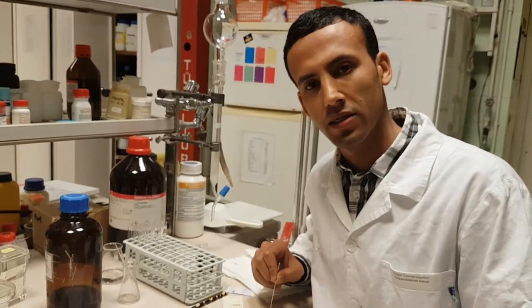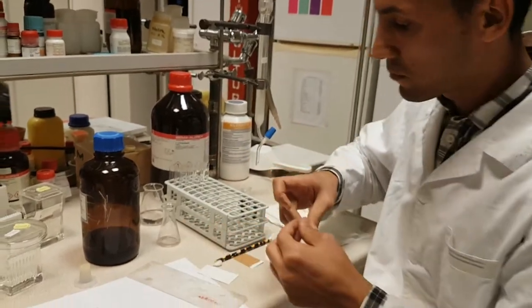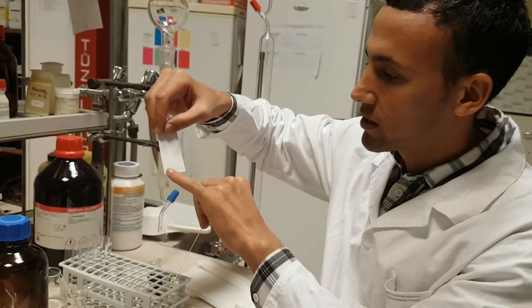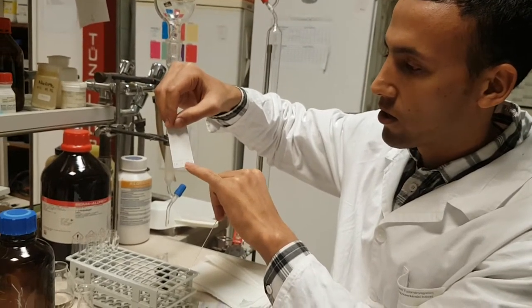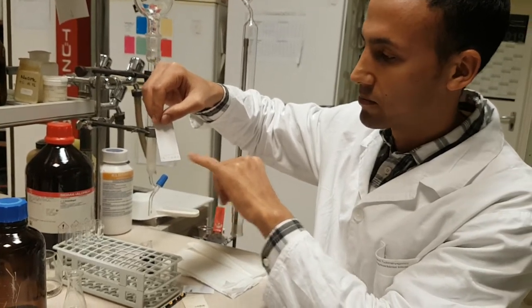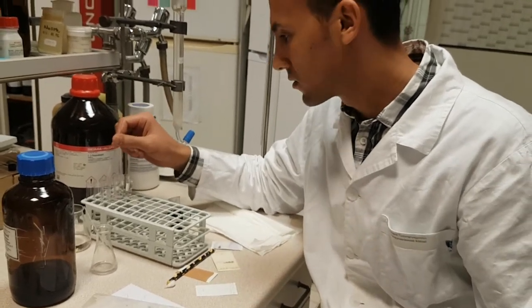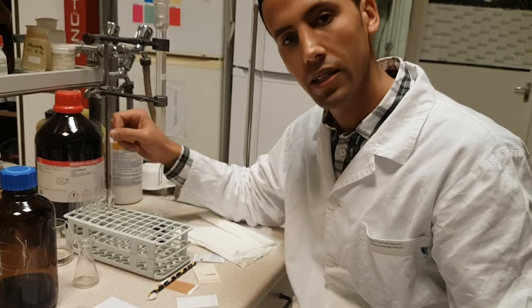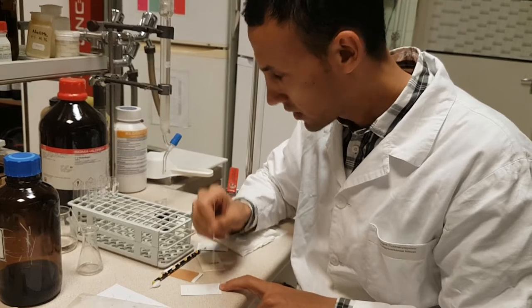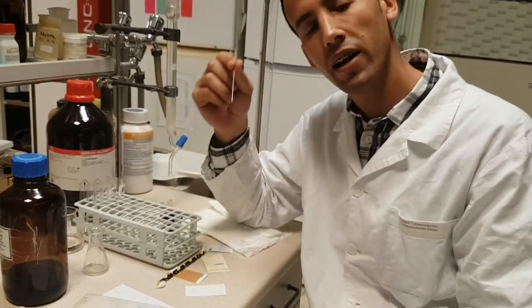Now we are going to spot from our tubes. Here, for example, we prepared a TLC plate, and we need to write the number of every tube, from 5 until 10, and spot from 5 until 10. So we spot here, and here, and here. Of course, you need to wash your capillary tube with acetone.